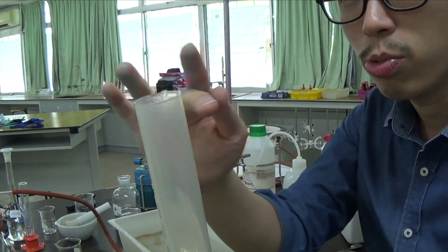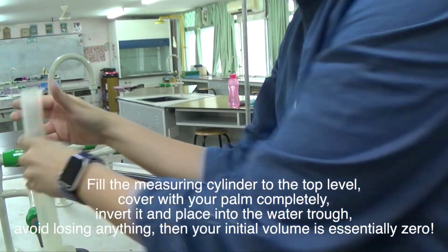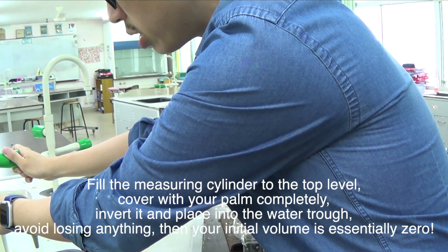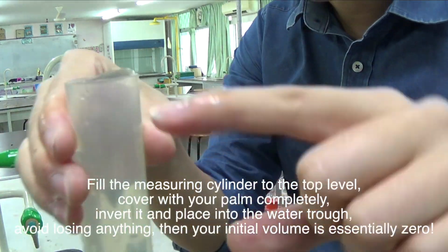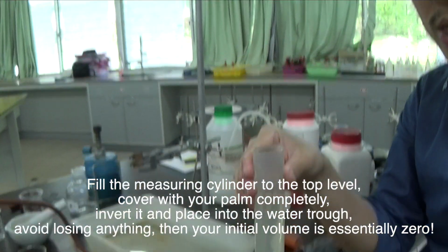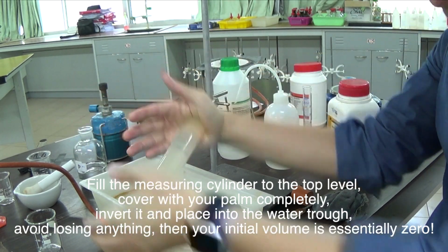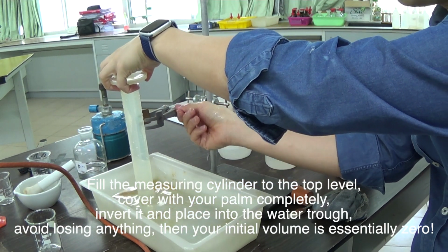So what we need to do is fill up this measuring cylinder with water. I'm going to go to my sink here, and fill up to the very top. Hopefully you can see this water level is on the very top here. And this is the important technique now: to invert it so that I don't lose anything. I have to close up the top when it's fully filled, and invert it into the water here.